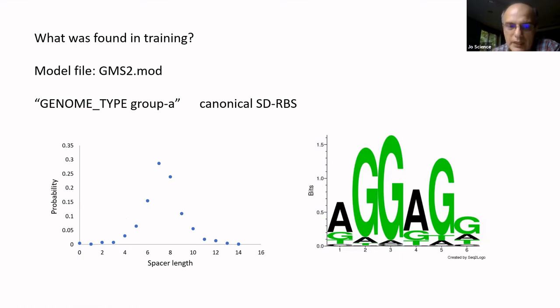And you see that this graph has a max around 7 nucleotides, a bell shape. So there is a preferred location. And when we are moving closer to the start codon or further from the start codon, the frequency of Shine-Dalgarno events drops. So again, the information about the shape was not given to the software. It learned on its own.